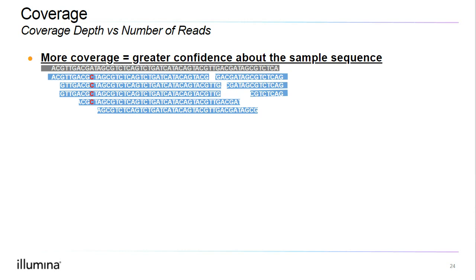You'll notice that in the DNA sequencing world, we talk about coverage in terms of how many X coverage is needed, 30X, 100X. For RNA sequencing, we use the absolute number of reads, and this is because RNA is dynamic, so there will be varying amounts of the transcriptome in various cells or conditions. So it's more difficult to establish a specific coverage for something that is varying, which is why we use the number of reads itself.